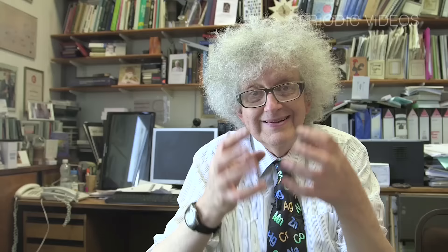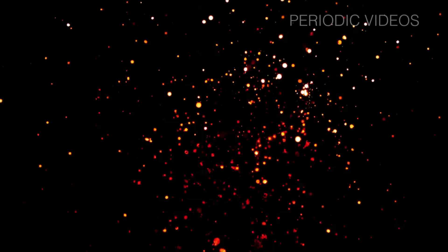But the formation of all of these is highly exothermic. It gives out a lot of heat. So, you have iron going into the liquid oxygen, producing a lot of heat, and because it's so hot, it produces a lot of light.